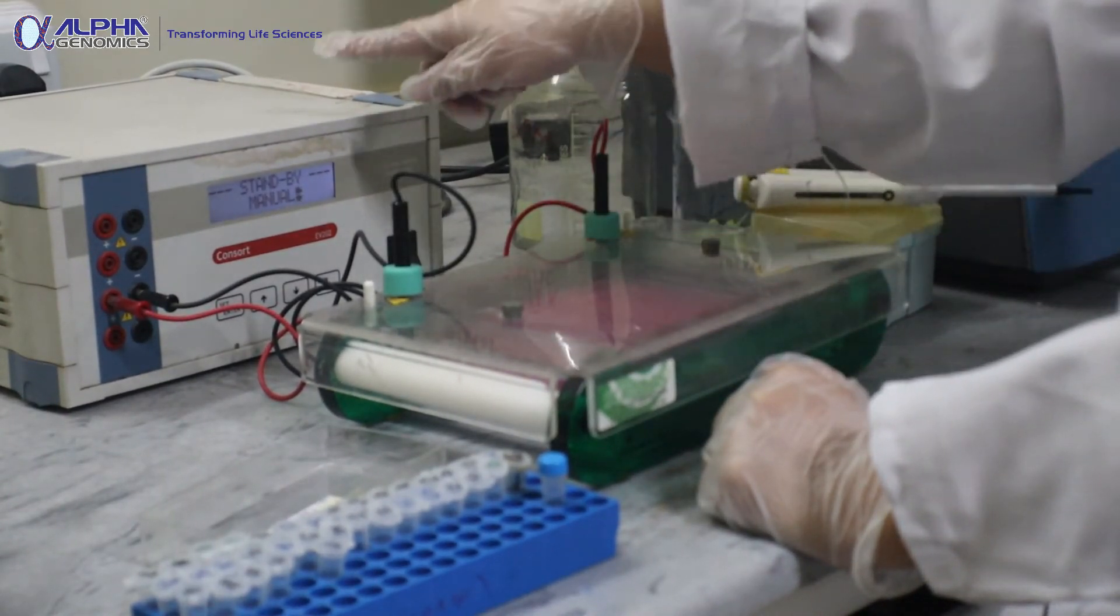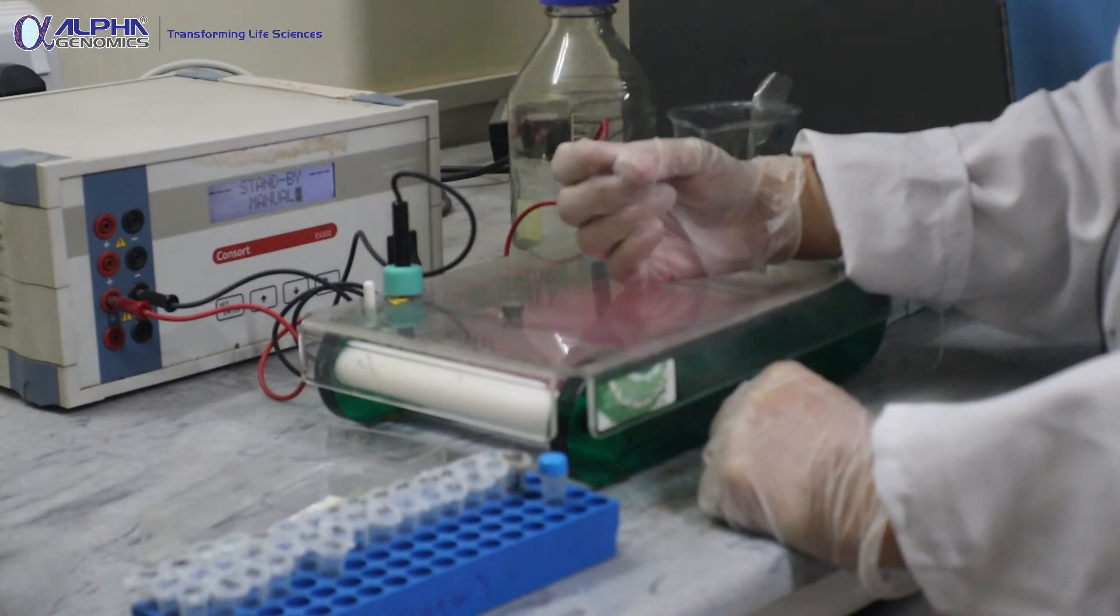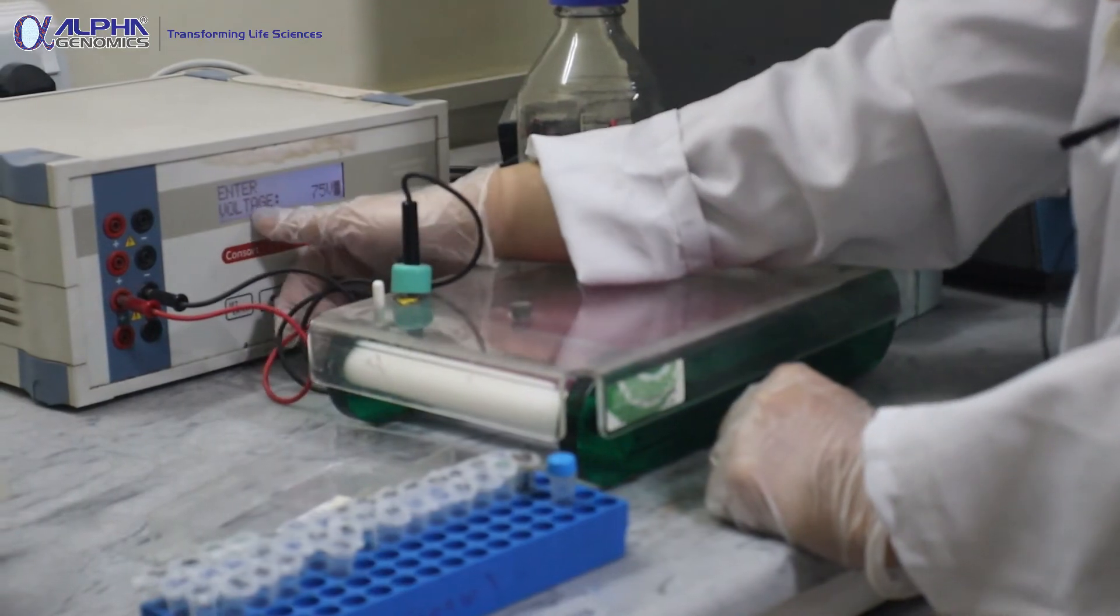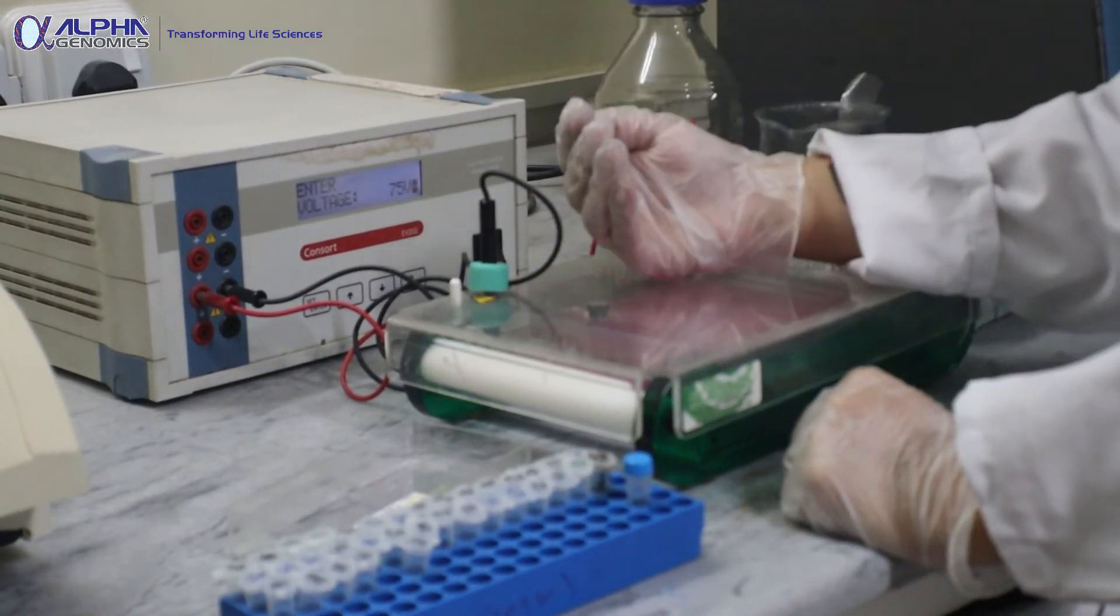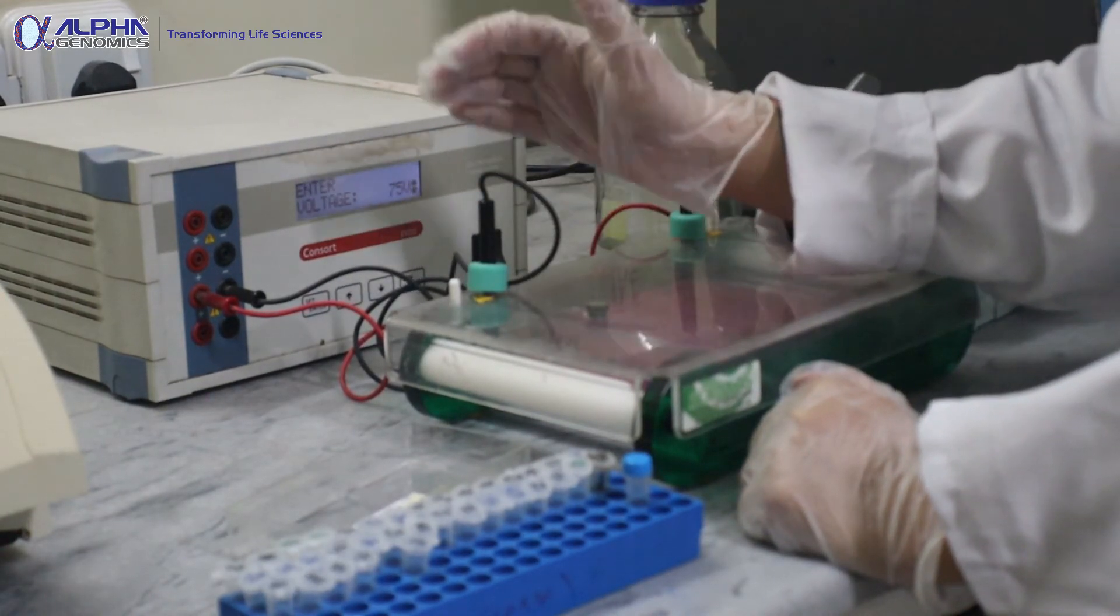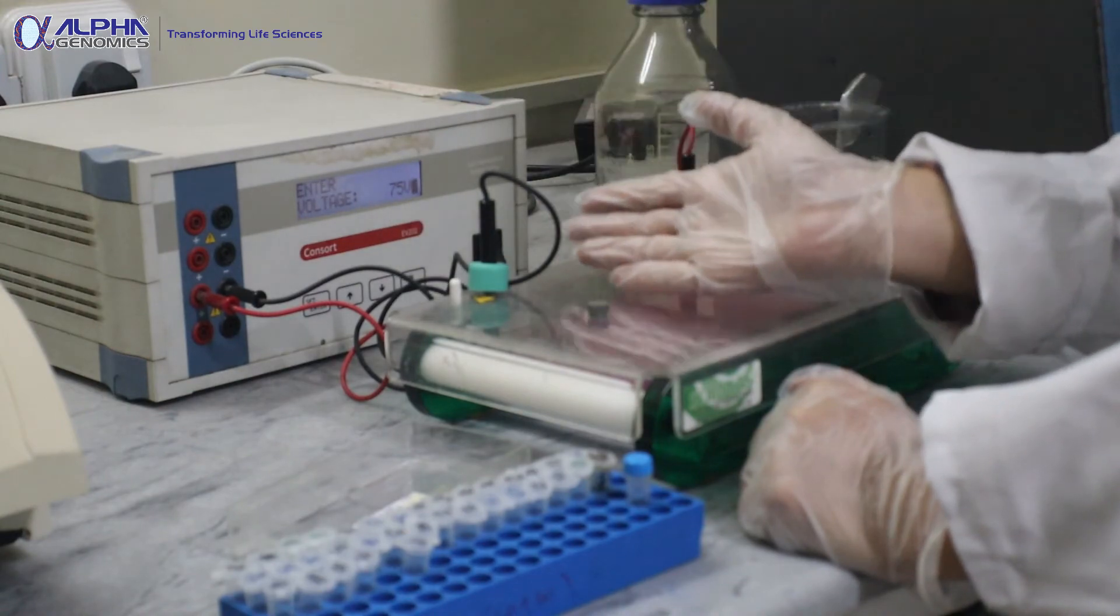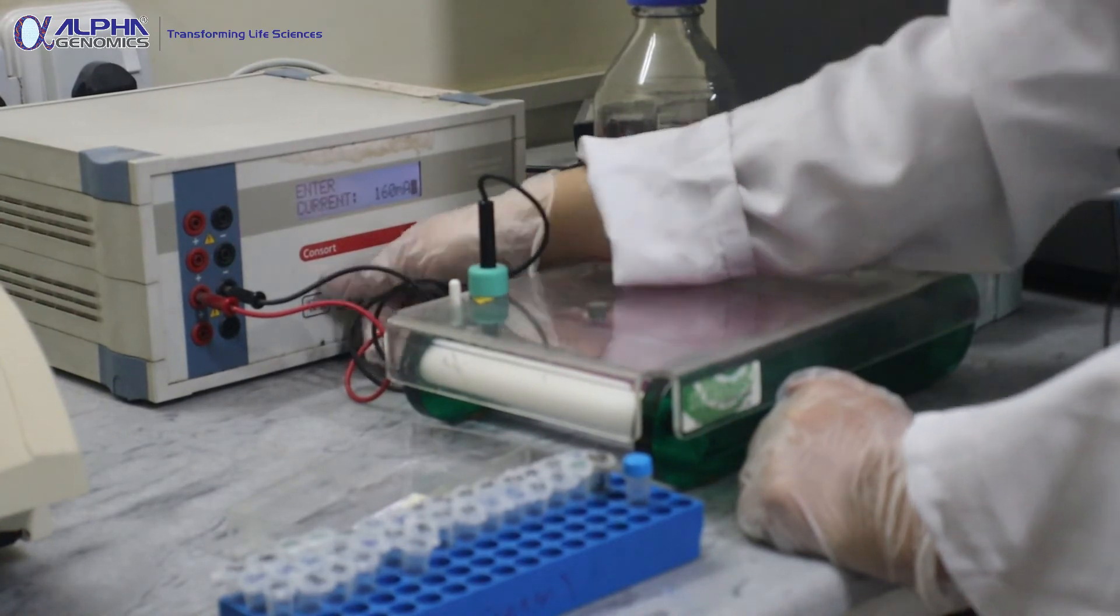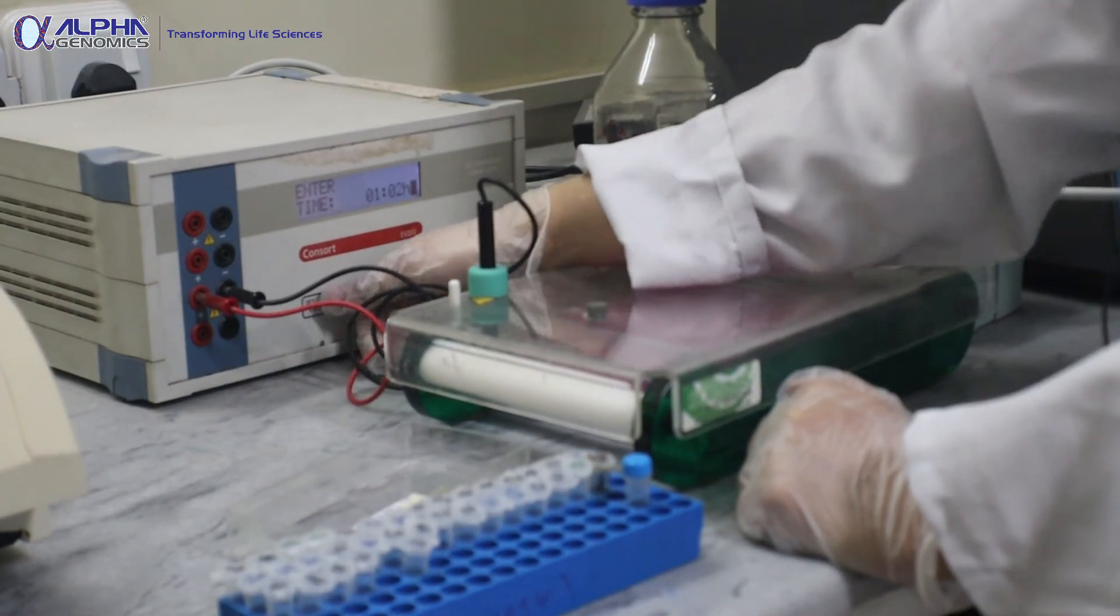DNA is heavier in nature. Now I'll set different parameters for running the gel. The voltage we normally use is 75 volts. Why is it 75 volts and not 100 or something? Because DNA is heavier so it requires a low charge and the time duration must be quite enough for its movement across the gel. I have set voltage as 75 volts, current at 160 milliamperes, power is 300 watts. Time I usually keep for one hour - one hour is enough time for a DNA molecule to move.